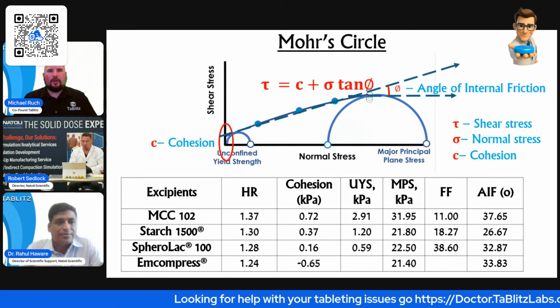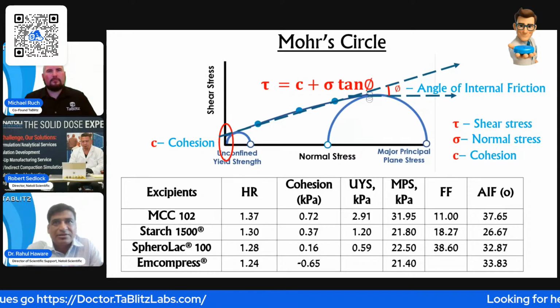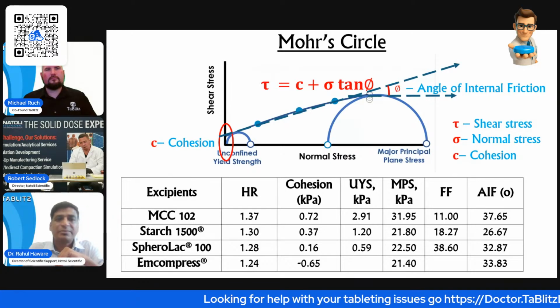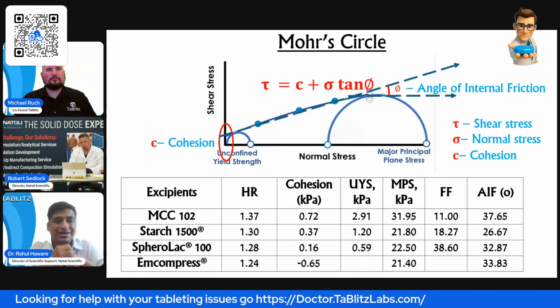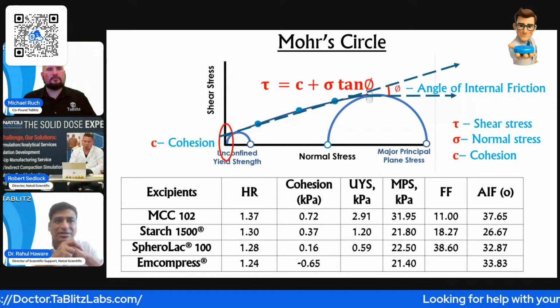And that's the real beauty of this new score, because it will help you identify challenging powders, since sometimes the Hausner ratio is very misleading. One of the reasons is the accuracy of measurement of bulk and tap density, because though it is given to 2 significant digits, unfortunately you can't measure the bulk and tap density with that kind of accuracy.